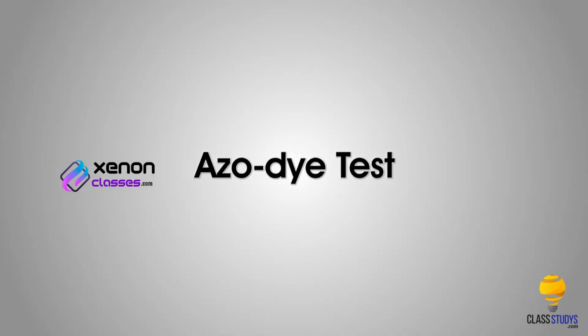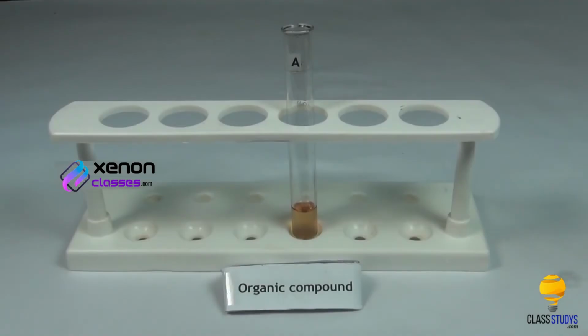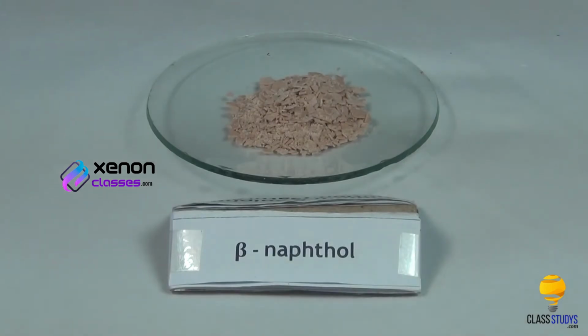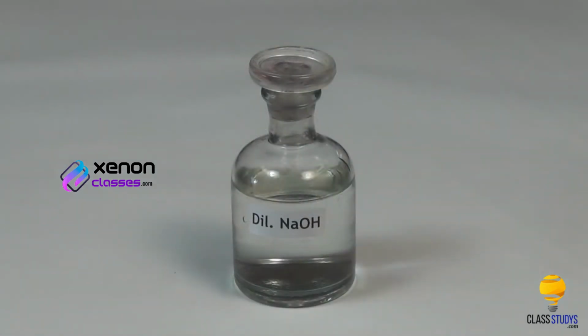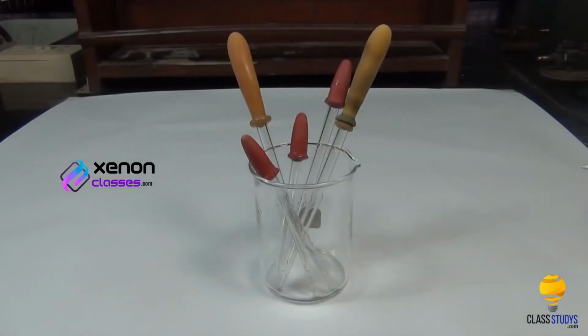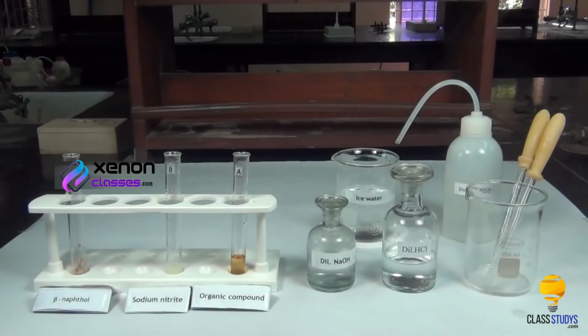Azo dye test. Materials required: organic compound, sodium nitrite, beta-naphthol, distilled water, dilute hydrochloric acid, dilute sodium hydroxide, ice-cold water, test tubes and droppers. Procedure: take small quantities of organic compound, sodium nitrite and beta-naphthol in test tubes A, B and C respectively.